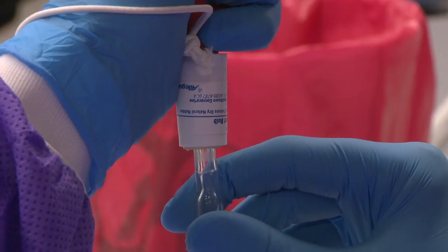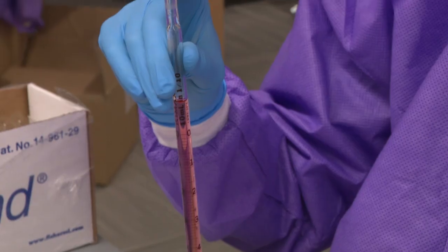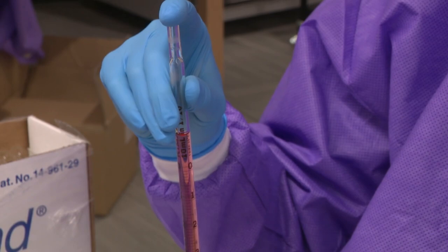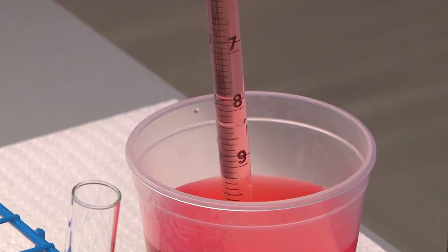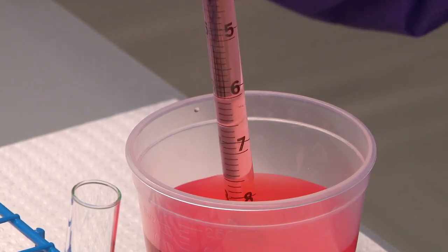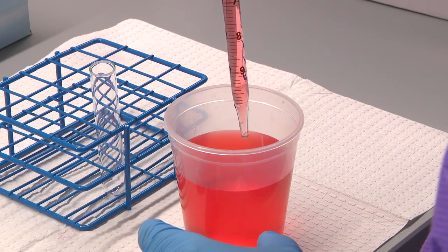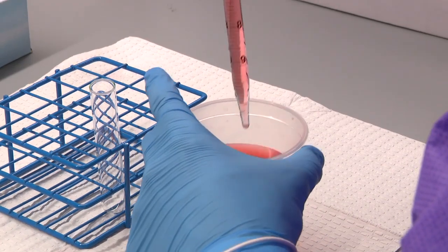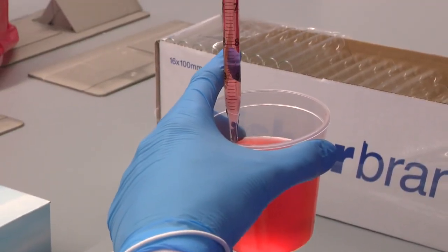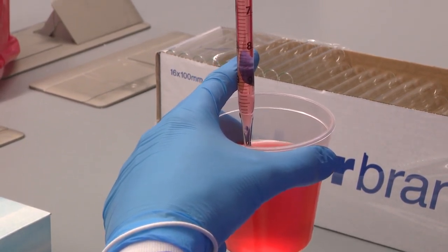Now remove the pipette bulb from the top of the pipette and quickly but firmly place an index finger over the top of the pipette to stop the water from flowing out of the pipette. If needed, you may use the bottom of the container for help. Remove the tip of the pipette from the water, but keep the tip hovering over the container and bring the meniscus to eye level. You may need to pick up the container so the pipette tip is not too far away from the container to keep any water from splashing.